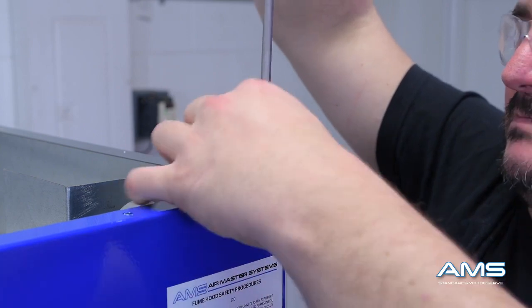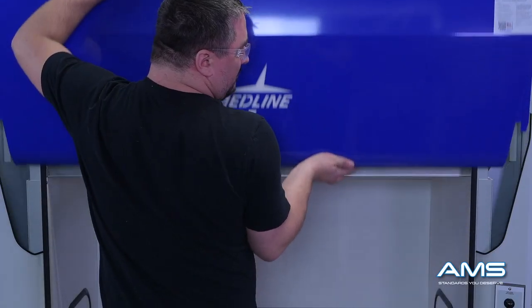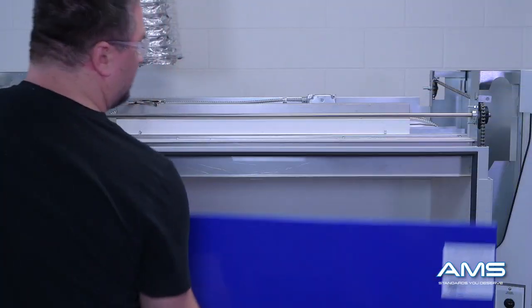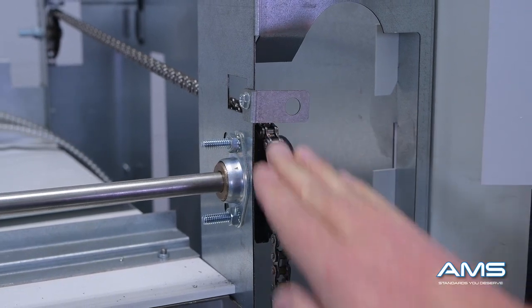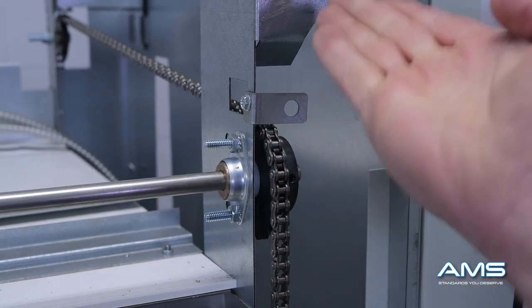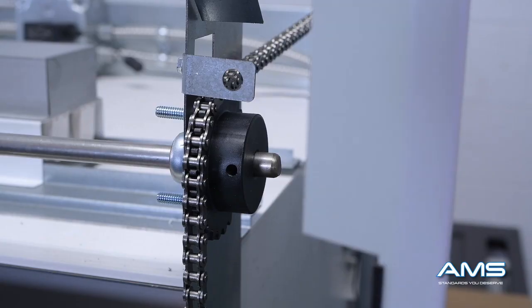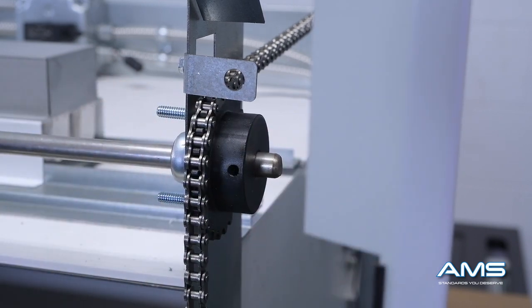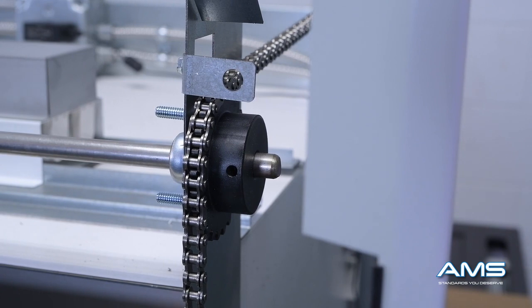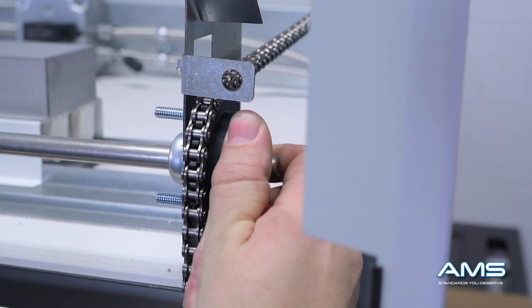If your sash does not come flush and you need to make an adjustment, you will have to remove the screws on the front panel and remove the front panel. Once the panel is removed you will notice there is a chain guard above the chain — this helps keep the chain from skipping off the sprocket when it goes up and down. Adjustments can easily be made by using an allen wrench to loosen the bolt on the sprocket, after which you can make the appropriate adjustments with the sprocket and chain linkage as needed.